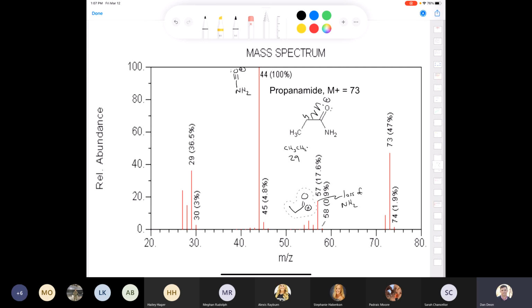Again, when you're annotating your mass spectrum, let's say you're trying really hard to annotate a base peak, okay? I'll accept either one or both. You can either try to identify the cation, so try to identify the actual fragment that's producing the signal or the peak, or you can do this.